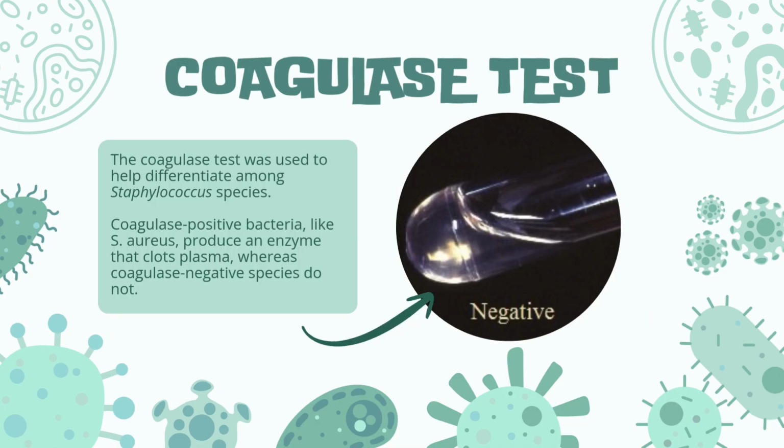The coagulase test was negative, which is one of the most definitive steps in distinguishing between staphylococcal species. This is because Staphylococcus aureus is coagulase positive, while Staphylococcus epidermidis will be negative. This final biochemical confirmation aligned perfectly with all previous results.